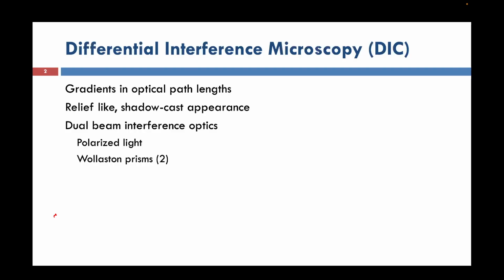So here we'll see the last variation of light optical microscopy, called differential interference microscopy. This is another mode of microscopy.